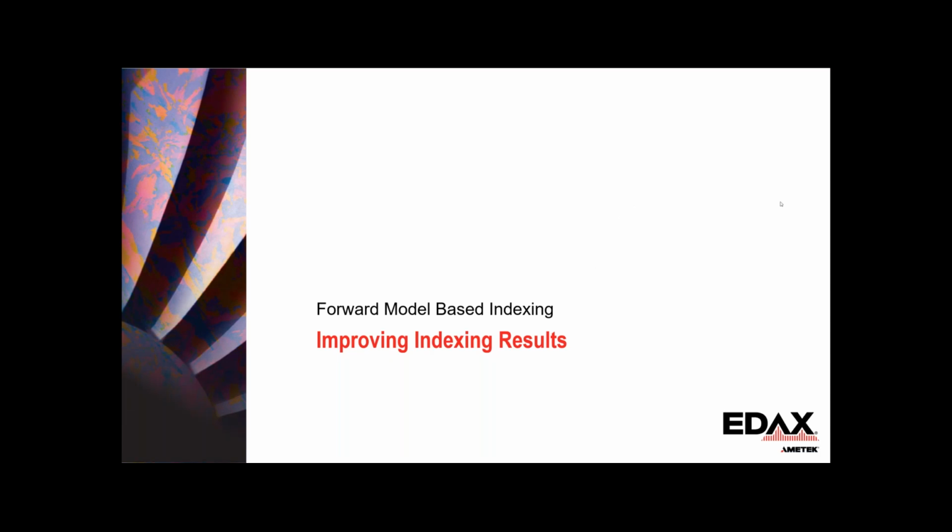Thanks, Matt. All right, hopefully you can see my screen. Like Matt mentioned, I'm going to be talking about forward model-based indexing in the new version of analysis.